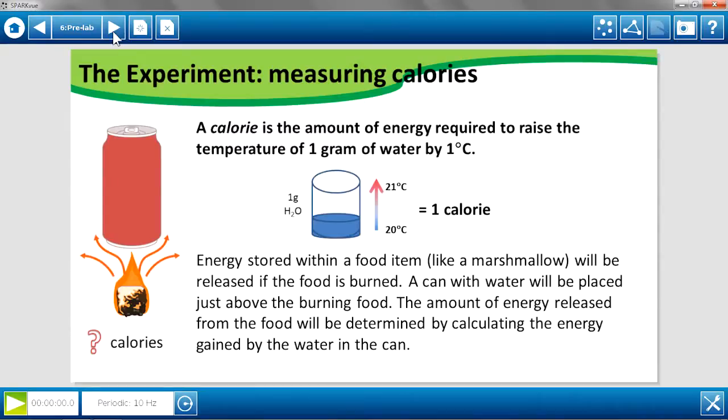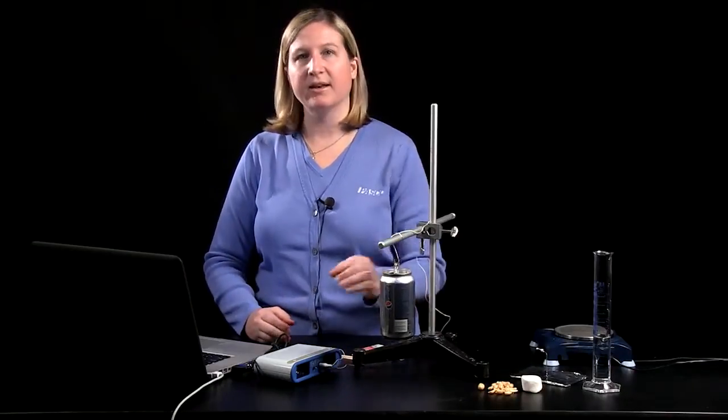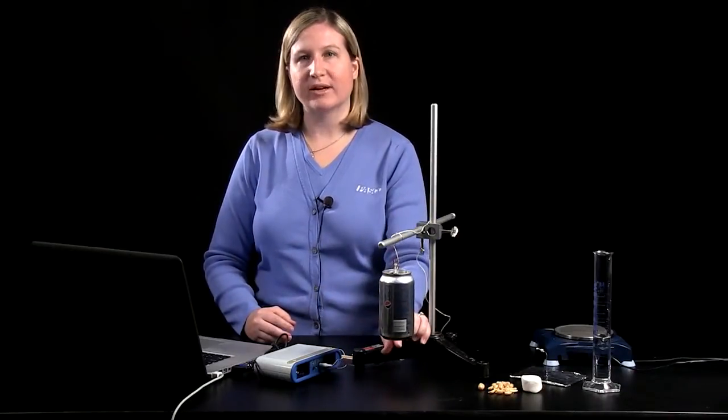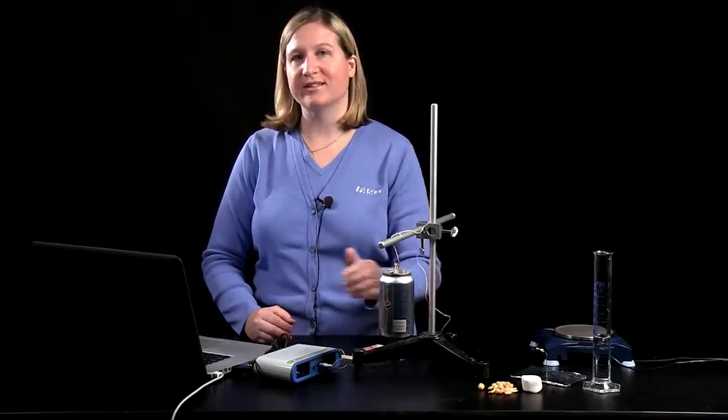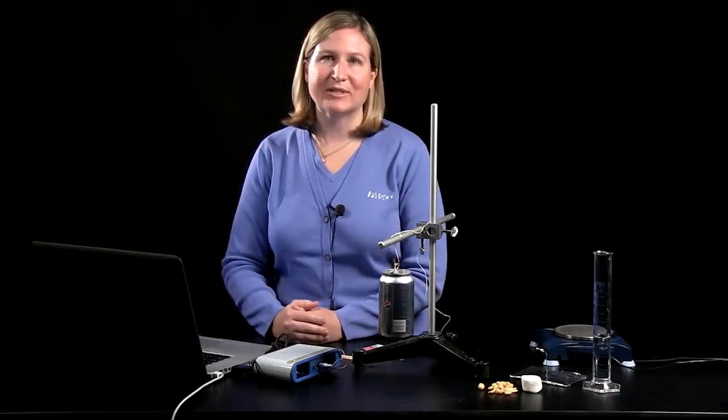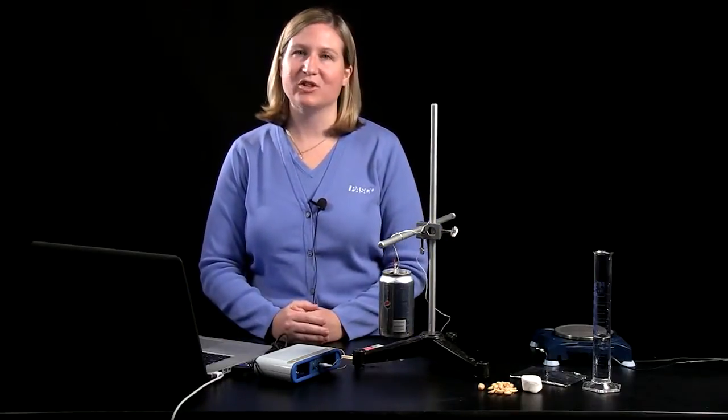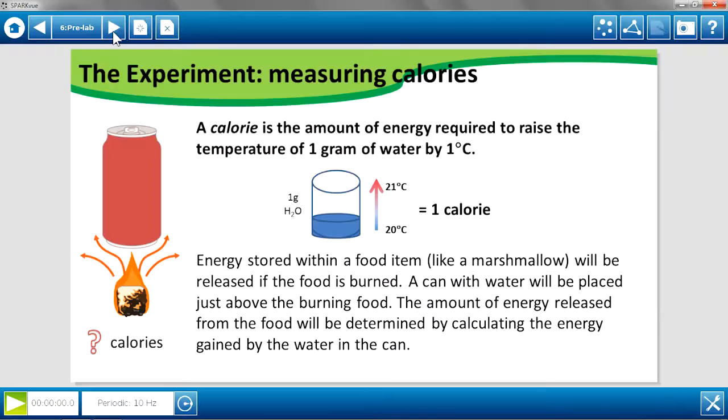So the experiment for measuring calories involves water being placed into a can. We're going to place a food item directly below that can and allow that food item to burn, transferring its energy to water within the can. Water is a good substance to heat. It makes the calculations really easy. Calorie is a standard unit of heat. It takes one calorie as the amount of energy to raise one gram of water by one degree Celsius.